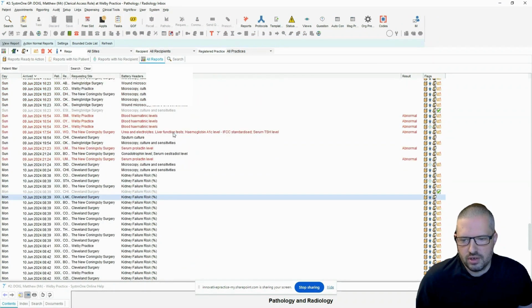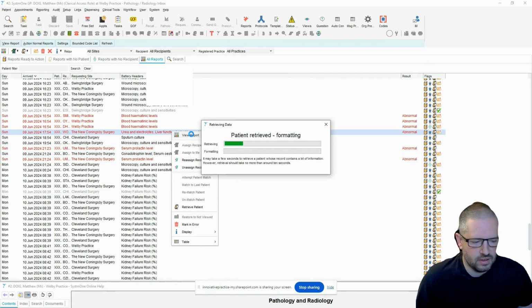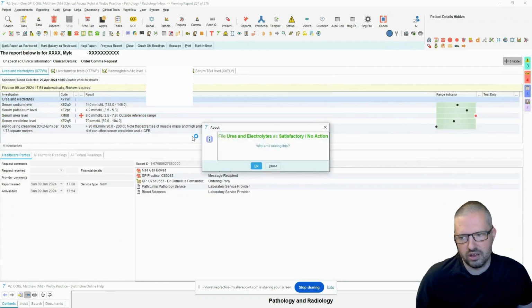Right, let's go. Here's a bit more of a list. Again, this may well have been done already. Probably should have asked people not to file everything this morning. Okay, good. So this pop-up here is telling me to file urea and electrolytes as satisfactory, no action.